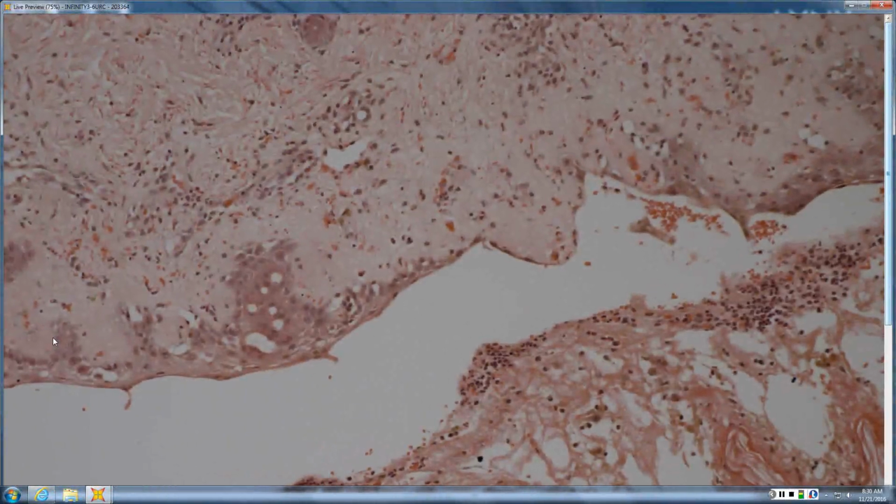Fixed drug tends to have a polymorphous infiltrate, but TEN, EM that has gotten impetiginized could also have lots of neutrophils. A little bit of deep pigment, so I'd give it a differential and then look at the patient, because it's usually going to be clear-cut one or the other, and I think we are right on the dot. Okay.